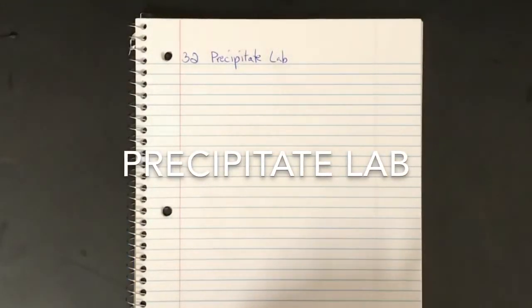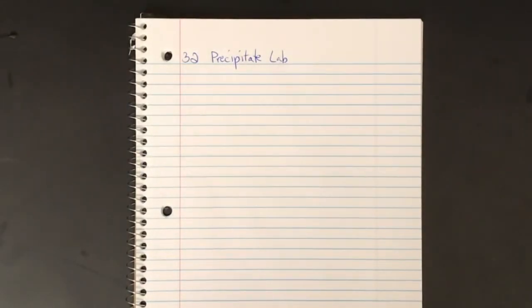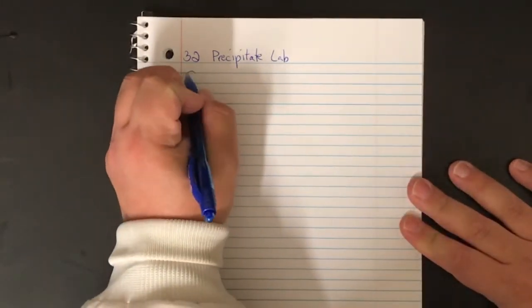All right, guys, it is time for our fourth and final Labapalooza lab. This is the Precipitate Formation Lab. To start with, we need to set it up in our notebook. It's going to be number 32, called just Precipitate Lab. Now, that word precipitate, we're going to talk about in just a second.